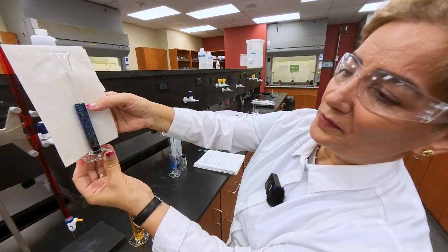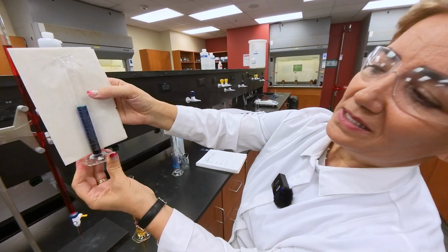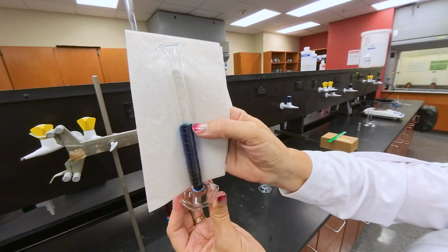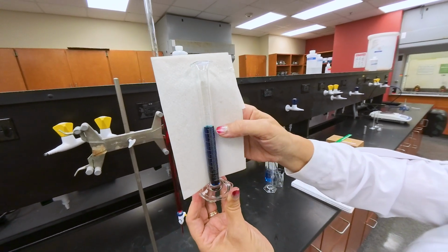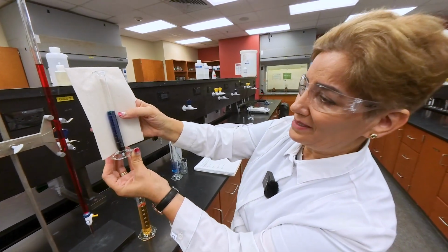So we know the liquid is between 7 and 8 in this case. Then there are smaller lines. Those are not imaginary lines, those are the number lines that we can see and that are provided by this measuring device for us.